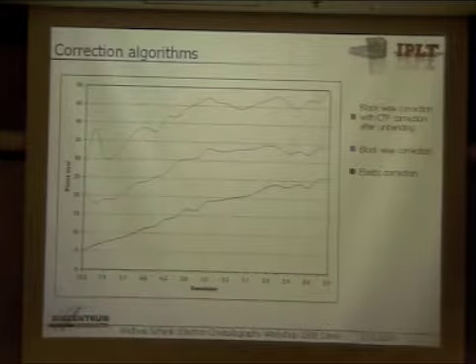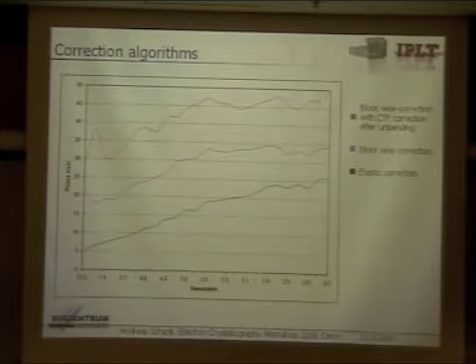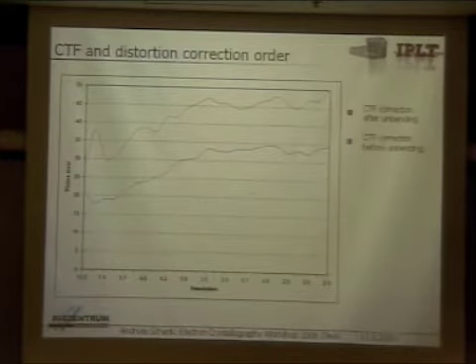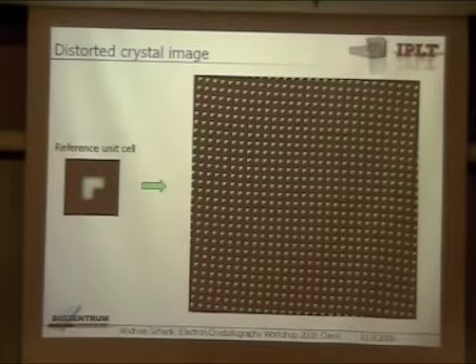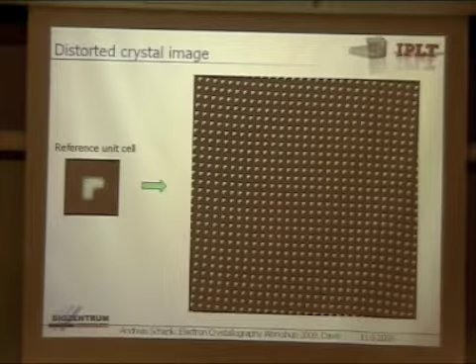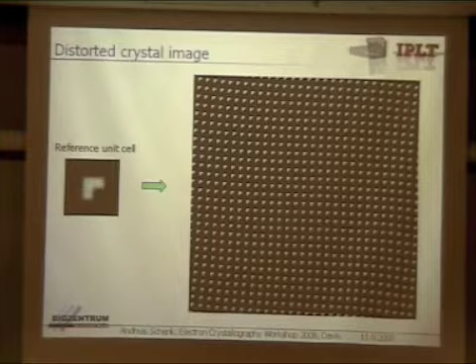I think the displacement you have shown here is not so dramatic. This is something which we see quite often. What was the maximum shift you had, if you look at the vector field? It's about a unit cell. Yeah, that's already quite a bit. So on the order of a unit cell, in a crystal 20 or 30 unit cells across. I'd say that's a lot of distortion.